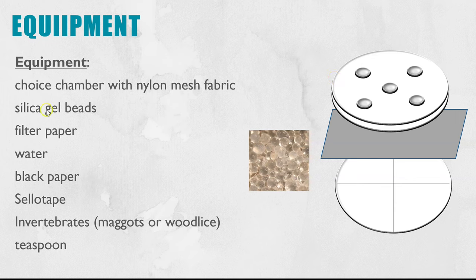To create a dry chamber we would add silica gel beads and these absorb moisture in the air. To create a damp or humid chamber we would insert filter paper which is soaked in water. To create a dark chamber you would cover the plastic in black paper and sellotape it down. We need the invertebrates themselves and so that you don't touch them use a teaspoon to collect them and then insert them in through the hole.